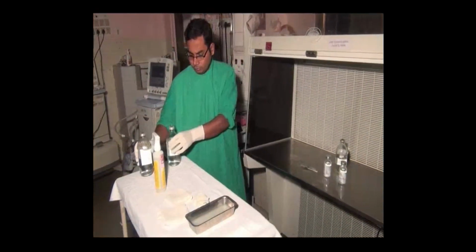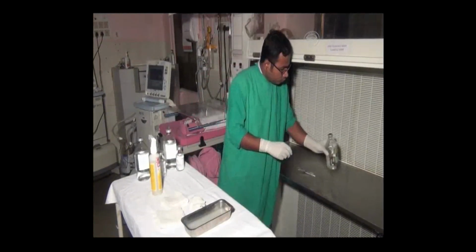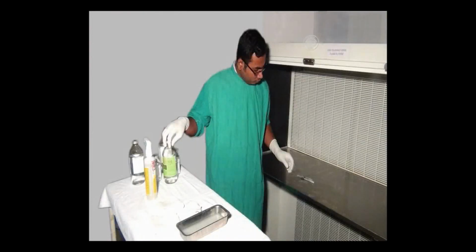Cleaning of the laminar flow hood. In the following section, we'll go through the steps of cleaning a laminar flow hood, because this is of paramount importance. Until and unless the laminar flow hood is cleaned diligently, it can itself give rise to a number of infections and hazards. In the next section, we'll go through 7 steps which will ensure, if properly followed, that there would not be any hazardous complication arising out of improper cleaning of the laminar flow hood.